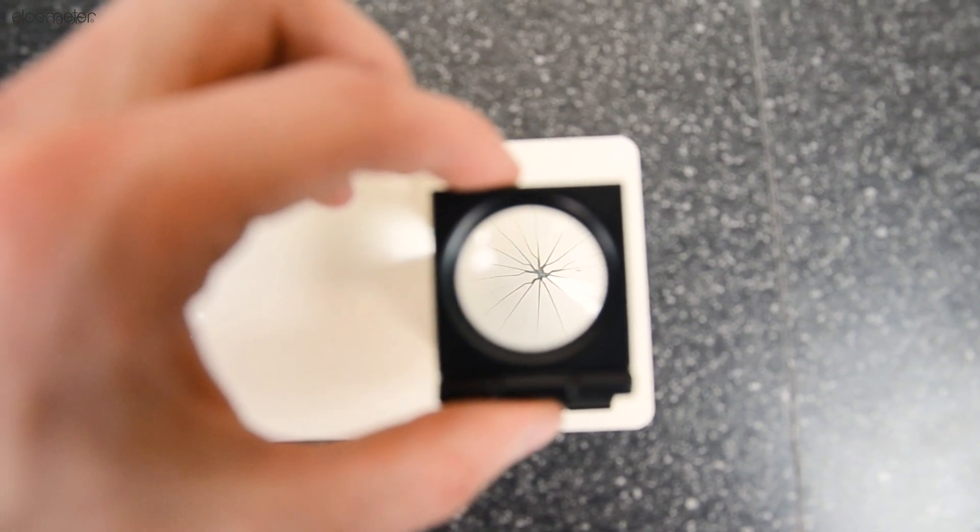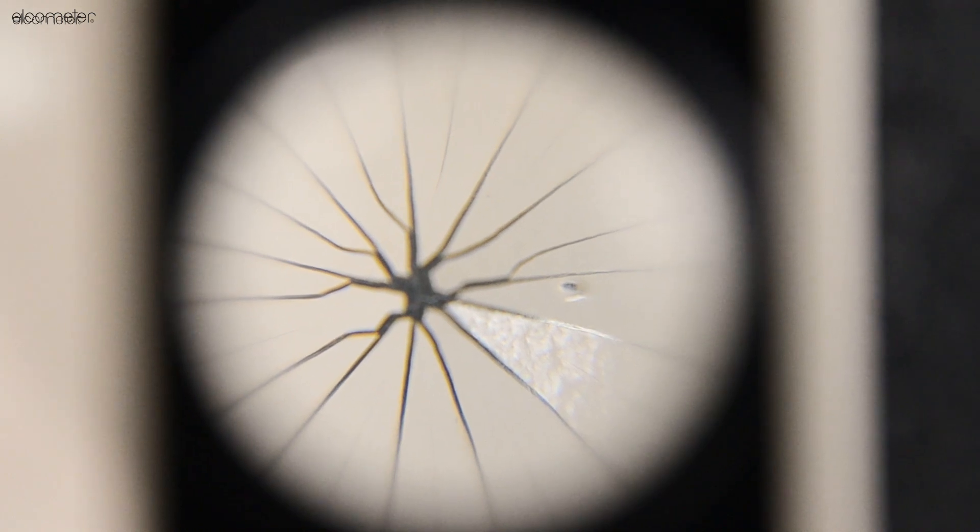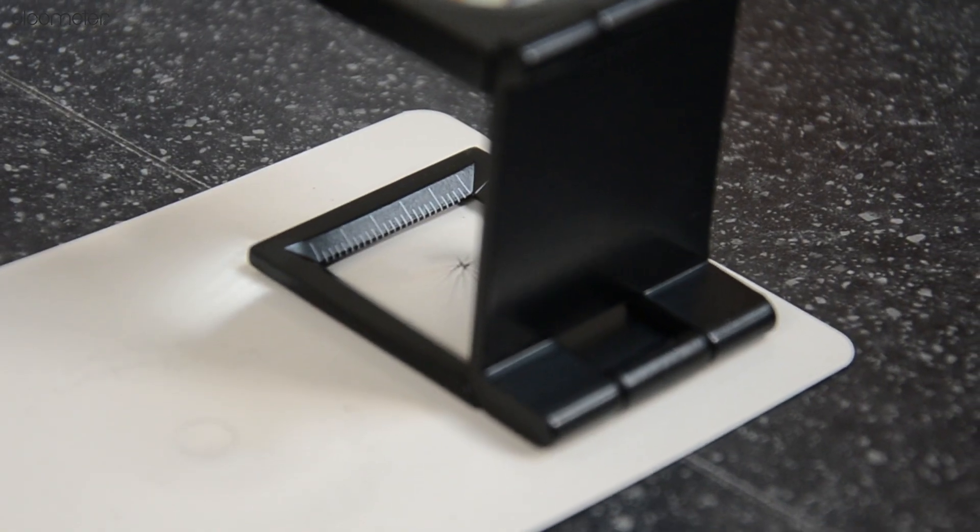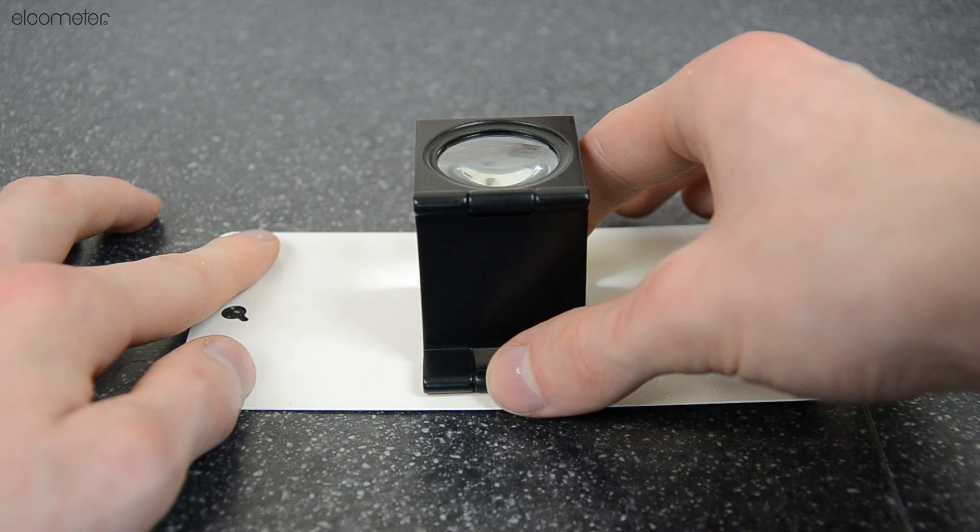The coating can then be inspected using the magnifier supplied to check for elongation, cracking, or peeling of the paint surface.